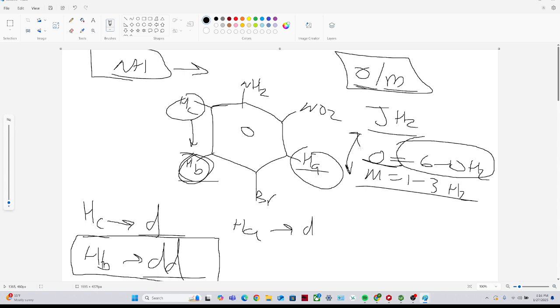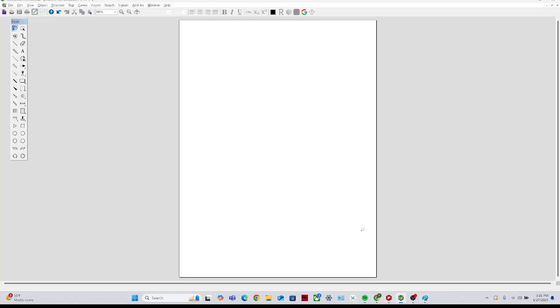What I do want to recommend, though, for future reference, is to take advantage of ChemDraw. So you don't have to watch the rest of this video if you don't want to, but ChemDraw has a really unique benefit where you can use it to create rough spectra for you. Don't use ChemDraw as an end-all, be-all tool, but at the same time, go ahead and use it to your advantage. And so what I do is the following.